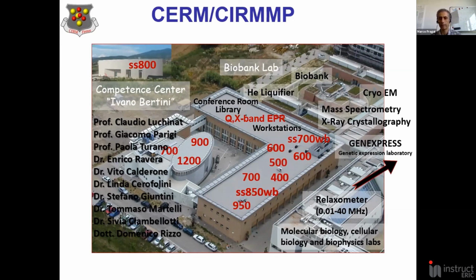We have used PEG of 1 kD up to 5 kD, 25 kD. There is everything on the market. However, the bigger the size, the more difficult the reaction is. In our experience, probably we are not so skilled in the conjugation, but we have obtained good results with 1 kD, very good results with the 5 kD. With the large PEG, probably you need a large amount of reagent and so on.